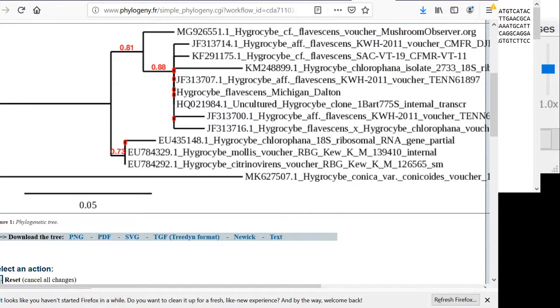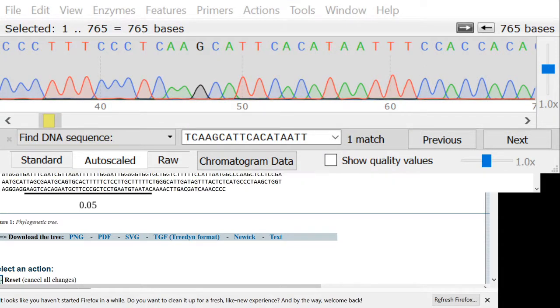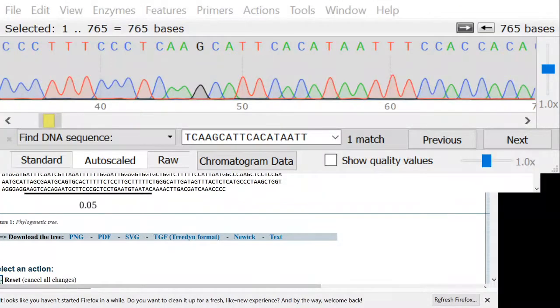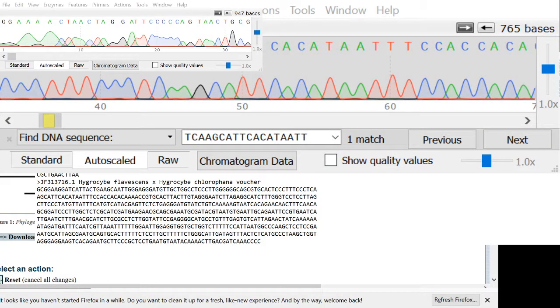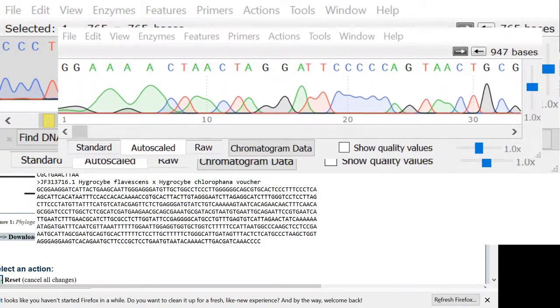I will show you now what it looks like when you have a sequence that's bad. Or not necessarily bad, but partially bad. Let's see, I think I have to add this over here to the stream. And we want this other one. Okay. So this other one is another trace I was looking at for someone yesterday.